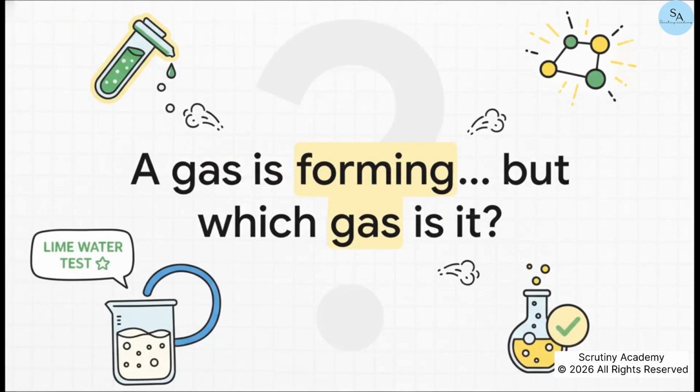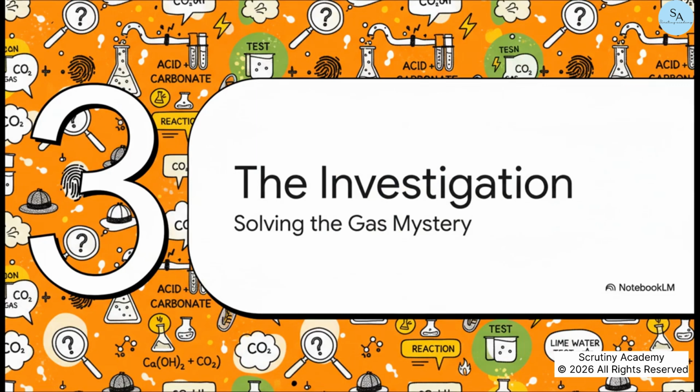So, this is the important question. We can see the bubbles, so we know a gas is forming. But which gas is it? How can we be sure? Every good scientist has to investigate. So let's become detectives for a minute and find out the identity of this mystery gas.